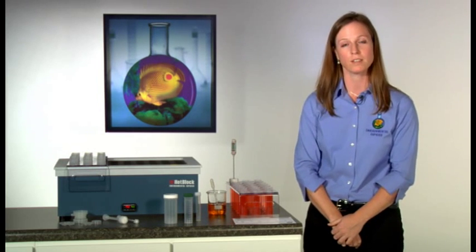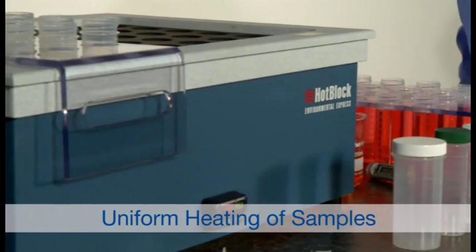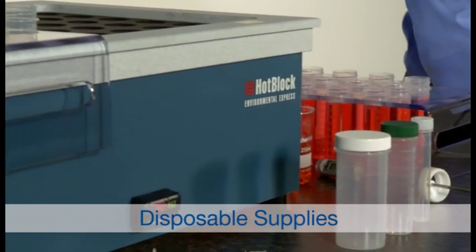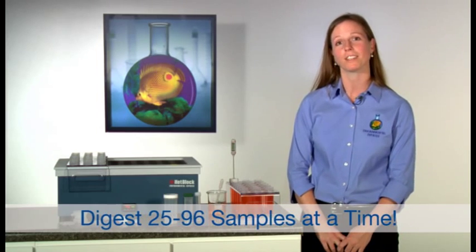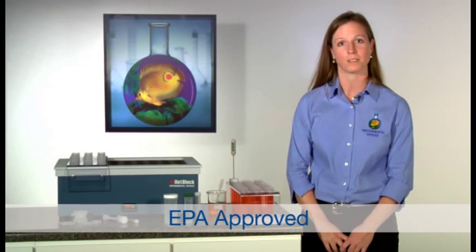They are now ready for filtration or analysis. The Environmental Express hot block provides a uniform heating surface, a corrosion-free environment, and the ability to digest 25 to 96 samples depending on the needs of your lab.